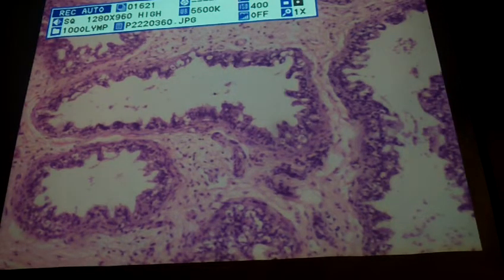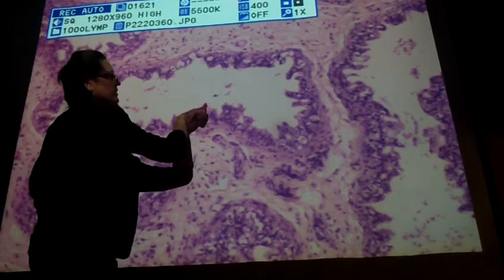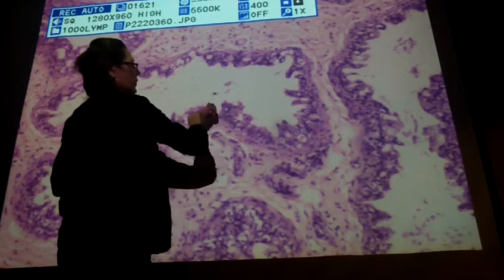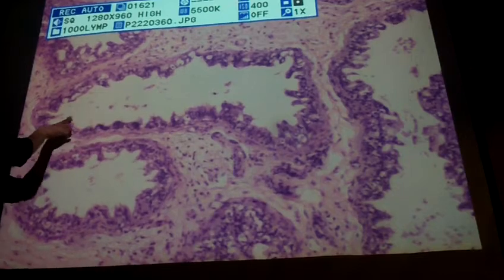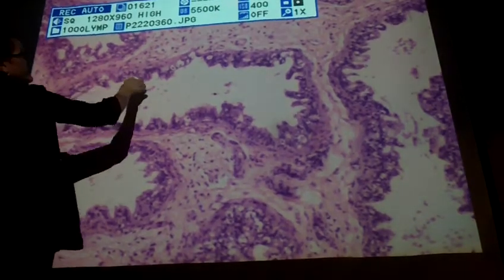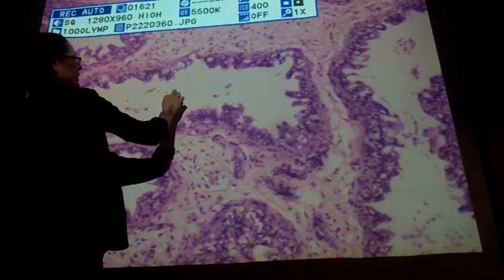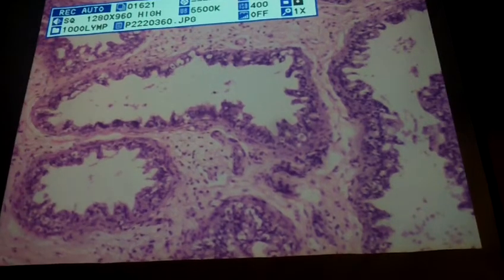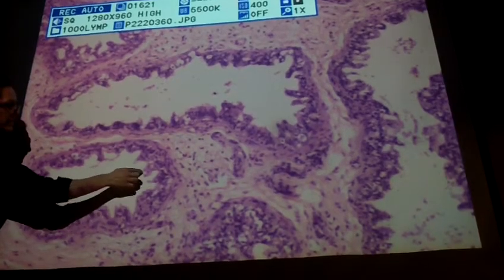And again, it's a little bit hard to see projecting it like this. You can see the microvilli better if you just take the fine focus and go forward just a little bit and back just a little bit. But you can see, it looks kind of ratty, or these things kind of sticking up. That's the microvilli here of the cells lining these tubules. So all of those little frayed areas, those are the microvilli. And again, what's inside of here, those are the sperm cells. So again, you can see that's a long microvilli. There's some microvilli.